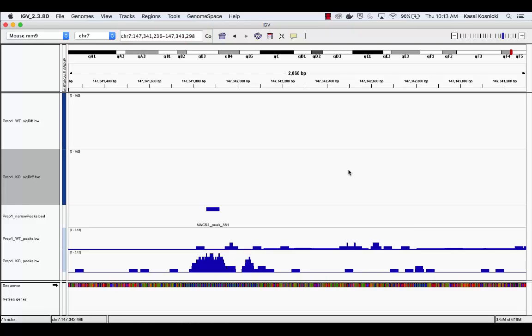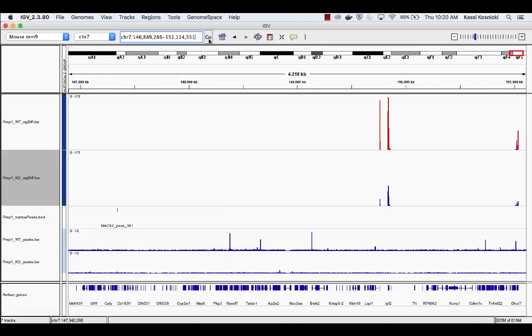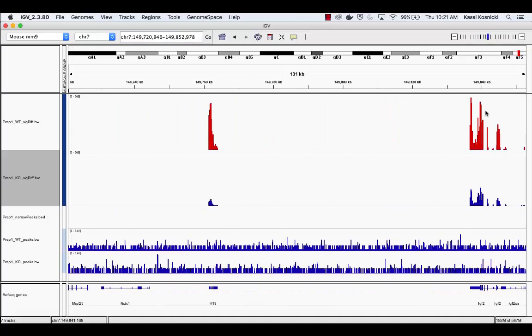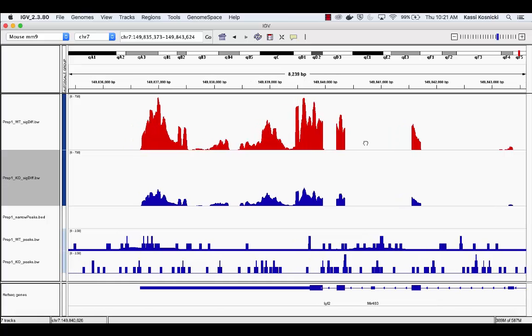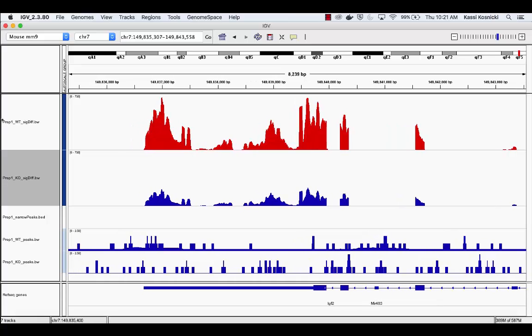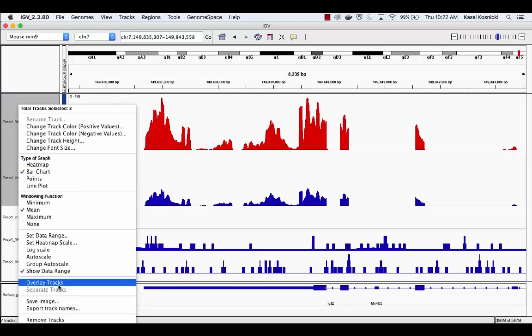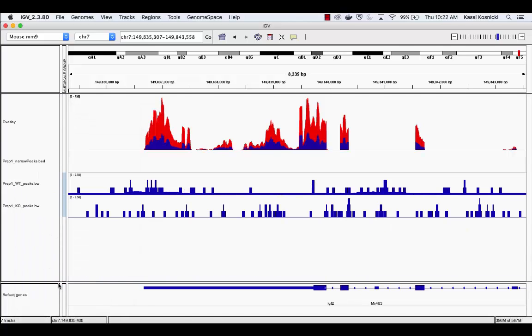Now, input the original region locus to observe how this binding event has regulated the IGF2 gene. Just as was done before, continue to zoom and scroll until both gene expression tracks are in the desired layout. Then, highlight both expression tracks, right-click, and select Overlay Tracks. This will better illustrate the differing gene expression between samples.